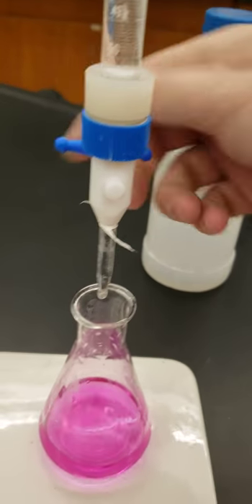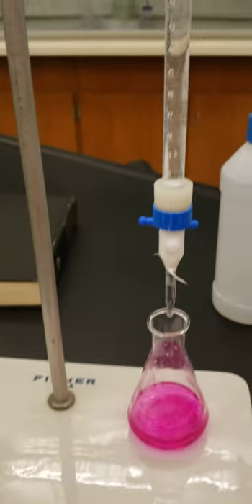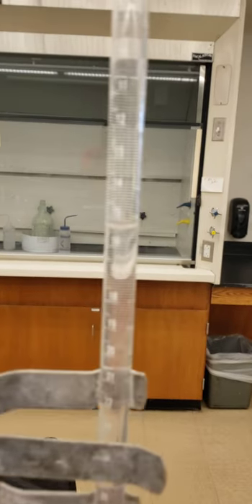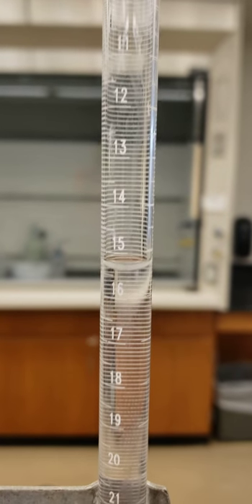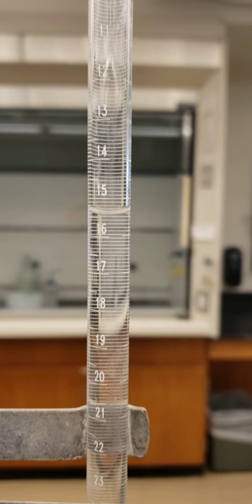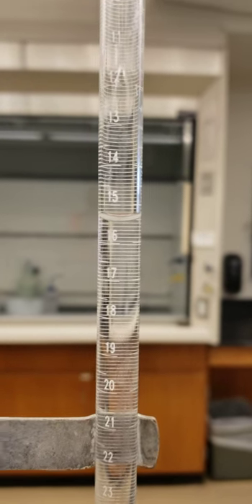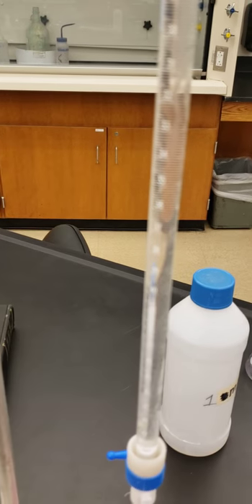There we go — got it. Went a little far but not too bad for how I was doing it. That's pretty good, and that gives us a final volume of 15.5 mL. I'll run two more trials and post the data for you.